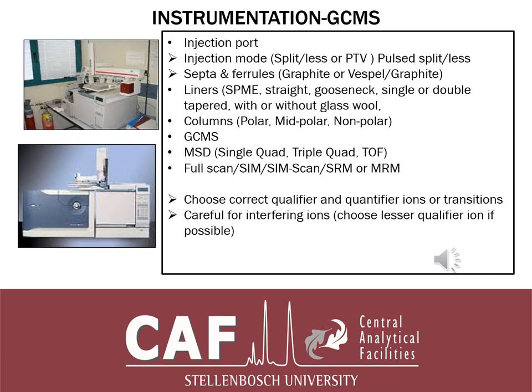And the mid-polar column is normally used a lot when one is analyzing fatty acid methyl esters. And non-polar columns are very versatile, because depending on the column, you can go up to 300. Some can go up to 350 degrees Celsius or 325 degrees Celsius, because they are stabilized with a siloxane, if my memory serves me well.